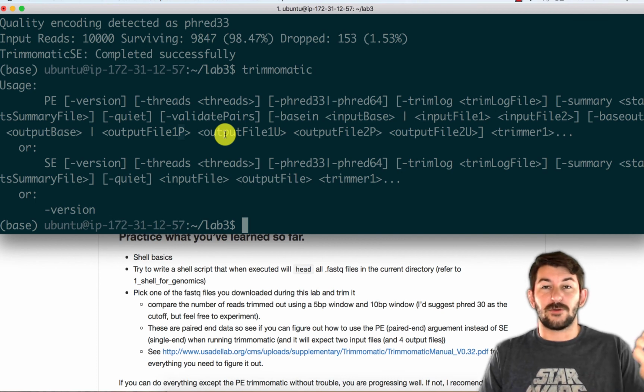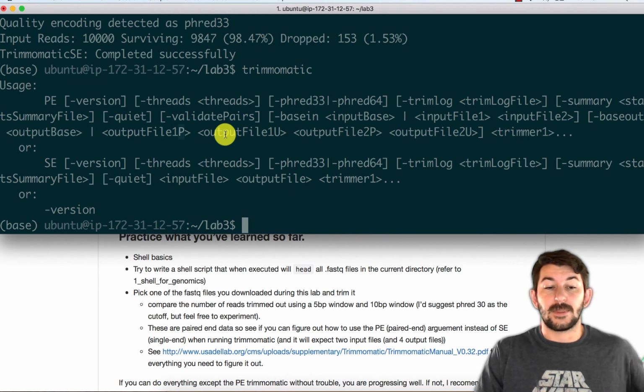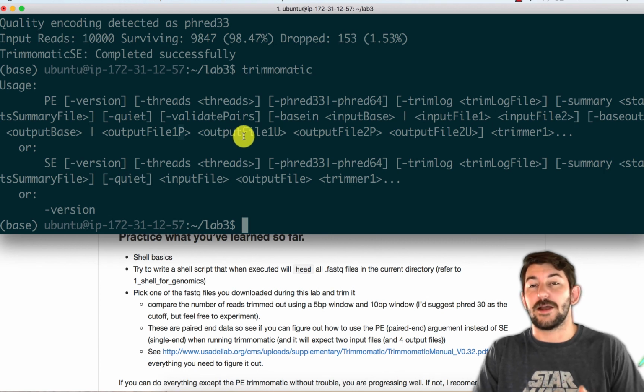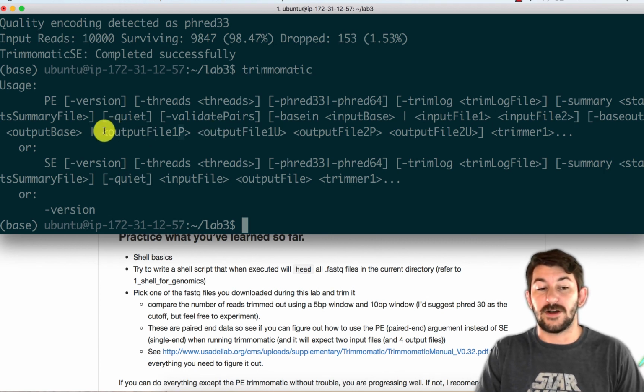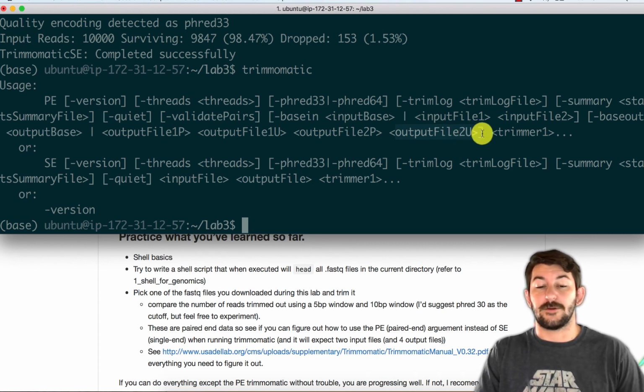So when you're trimming both paired reads, you only want to end up with files that still have pairs. So if you trim reads from one file but not the other, you need to get rid of its mate, basically. And then rather than just deleting them entirely, those unpaired mates go into an unpaired file. So that's why there's going to be 4 output files: for the _1s with a pair, _1s that are now unpaired, _2s with a pair, and _2s unpaired.